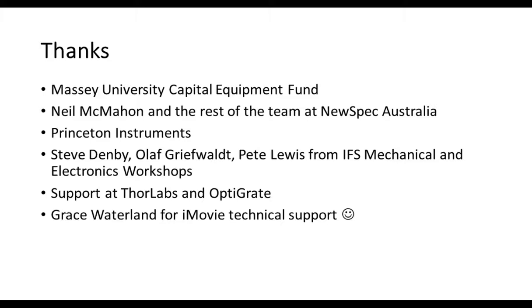Okay. Other than the Olympus, have you coupled the FERGIE to any other microscopes for Raman analysis applications? No, we haven't, and that's purely because we haven't managed to get our hands on another microscope yet. But I couldn't see any problems at all, so long as the microscope has a side port for sending the signal out of the microscope, then you should be able to follow exactly what we've done. And I think what Pong mentioned before with the cubes, which sound really good, we might purchase one ourselves. That ability to use a cube to couple it to the FERGIE should make that setup process pretty straightforward.